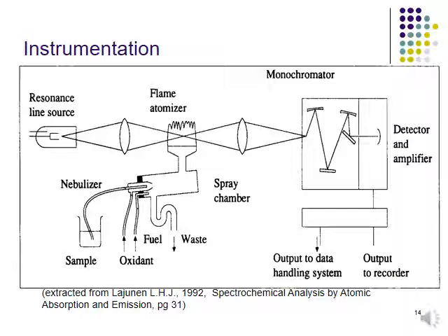After passing through the detector and amplifier, it will go as an output. Basically, for AAS, it will give you the value of the absorbance of your analytes.